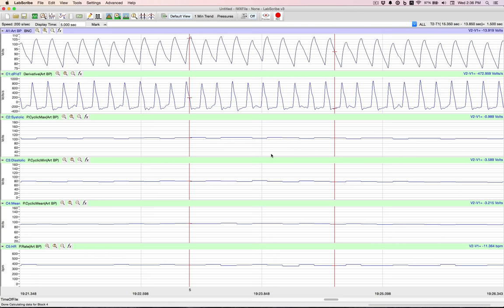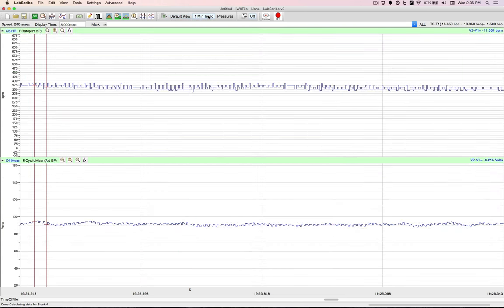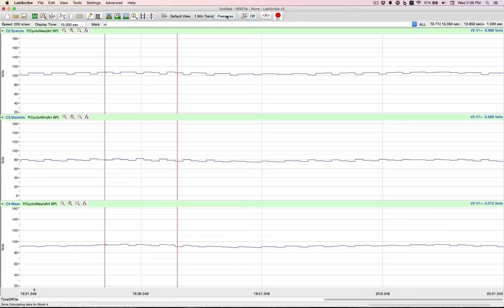Now when I go up to the view, I can switch to either of those. Let's go to the one minute trend. There you have it. We'll go to our pressures.